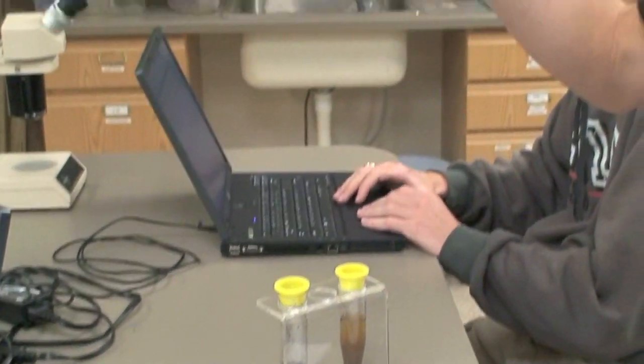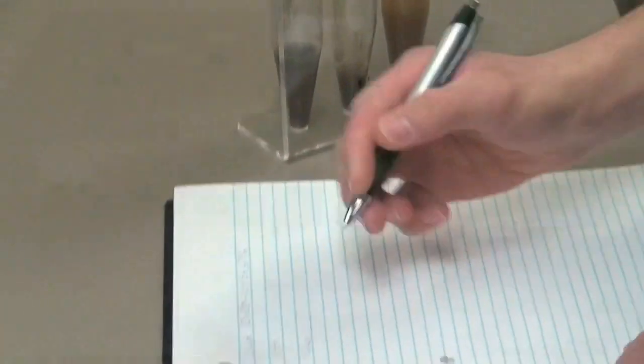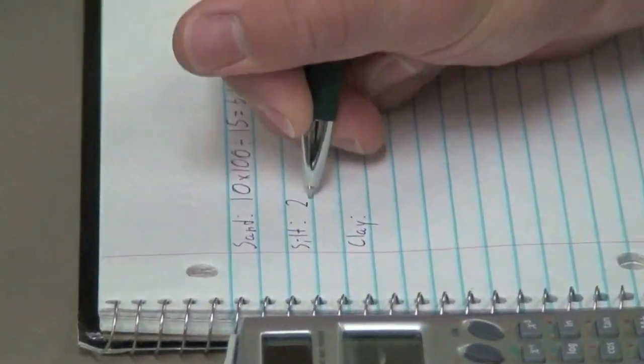Now look at the silt level in the second tube. Multiply the reading by 100 and divide by 15.